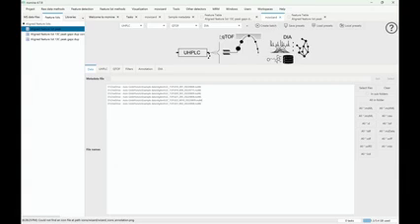We did add some more security features inside mzmine. If we save the parameters that you applied, we also want to save what kind of feature lists and raw data files the steps were applied to. Then we kind of went too far, and it was breaking version 4.7.0 or 2. I don't know, 2 was broken in that manually going through, sometimes you couldn't select the feature list. But in the wizard and in the batch, if you applied it there, it should have worked. Just update to the new version, and it's going to be fine.